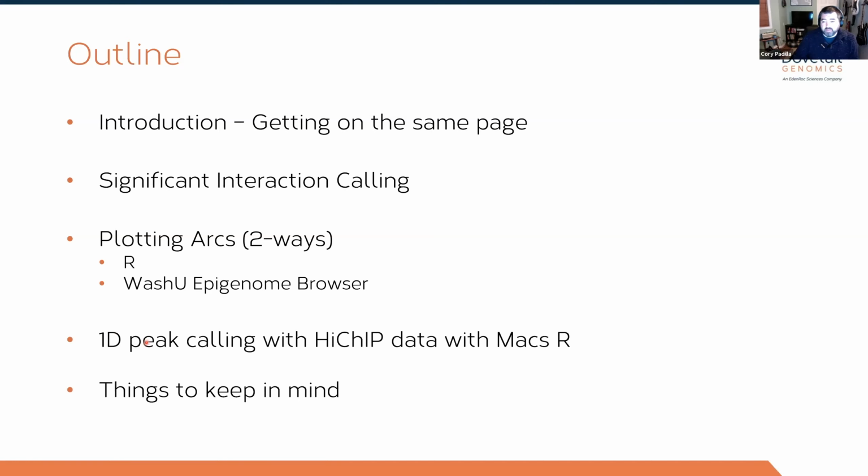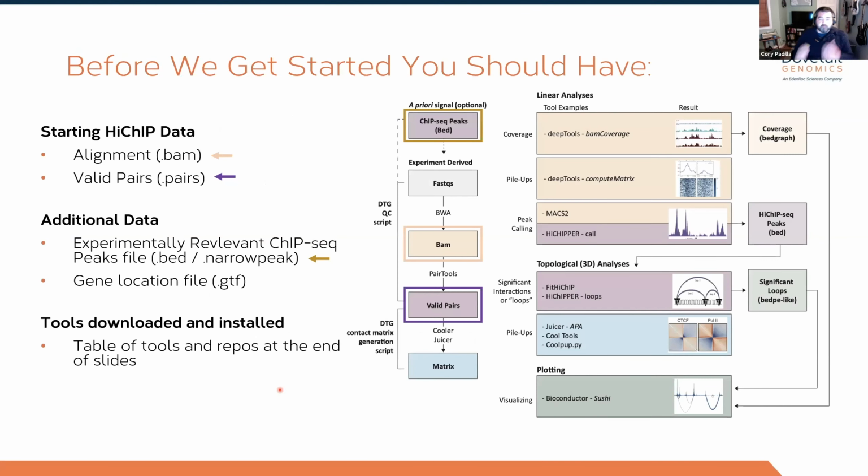One, how to do it, and then also things to keep in mind if you are to use HiChIP data in calling one-dimensional peaks. And then I'll just end with some general things to keep in mind as you move forward.